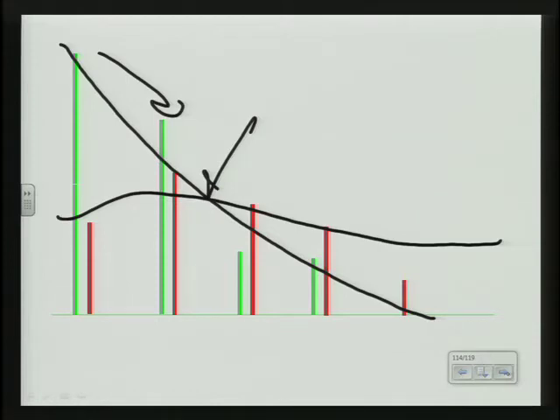Looking at a profile like that, I would not have been tempted to interpret it as a major and minor because I'm seeing loci where I'm a lot closer to 1-to-1. Do you see profiles where I wouldn't have that warning and the crossover would come without going through an intermediate area where I would not be comfortable separating out a major and minor at all?